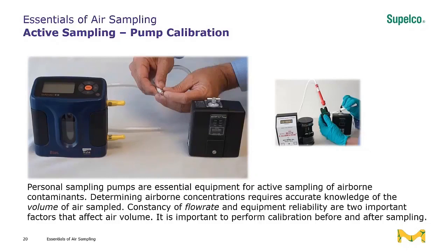And then after sampling, this also needs to be done again to ensure that the flow rate and the volume collected was maintained, or at least within the deviation required for the device.